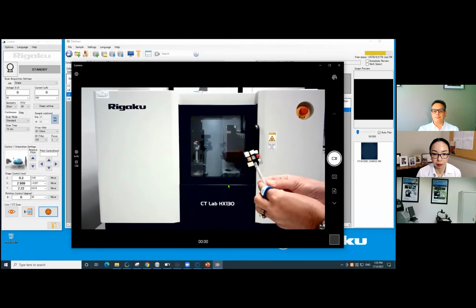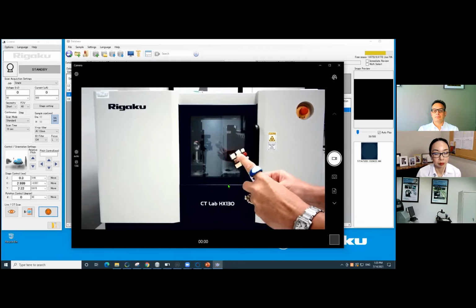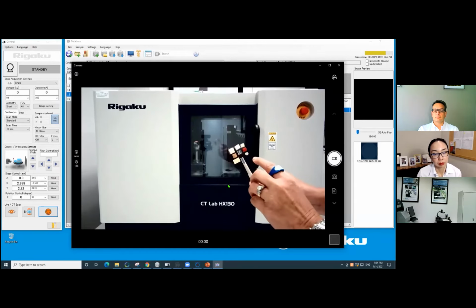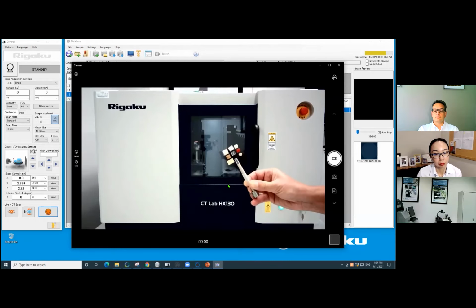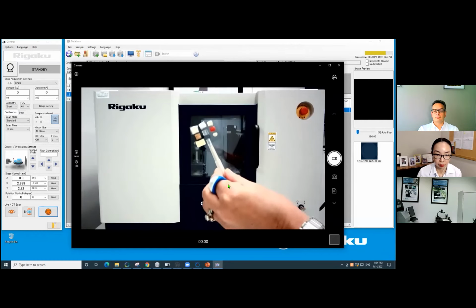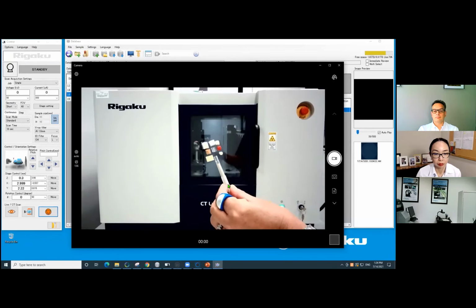So quite often we use tape. I use double-sided tape to adhere that candy wrapper onto the stage. We use foam a lot, mounting clay, cork material, plastic. There's paper. Sometimes things are wrapped in a paper container, and then we use a variety of waxes to mount samples. So it turns out some of these are better than others for mounting materials.